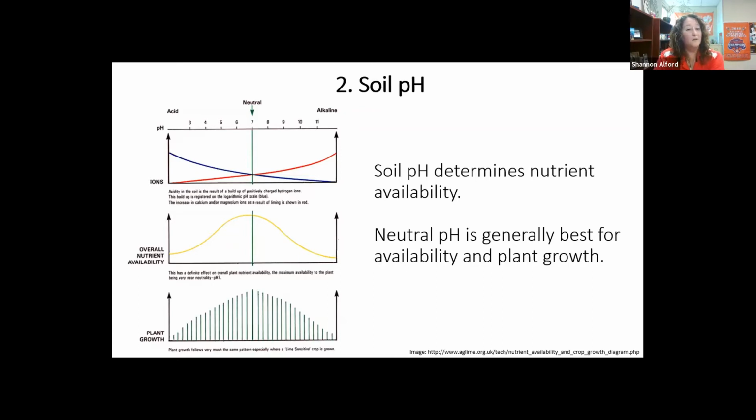And the higher the pH value, the closer to 14, the more alkaline or basic the soil is. We don't tend to see very alkaline soil here in South Carolina. But if we do come across a sample like that, we definitely do a recheck just to be sure we've gotten the right result. We even flag those kinds of samples.